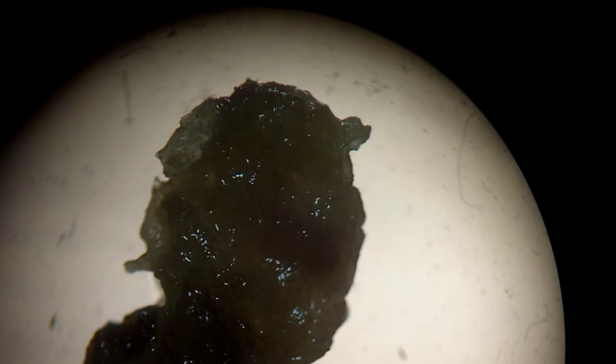This is a sponge. This is a large macro sample of the Leucosolenia sponge. This is the dissecting scope.